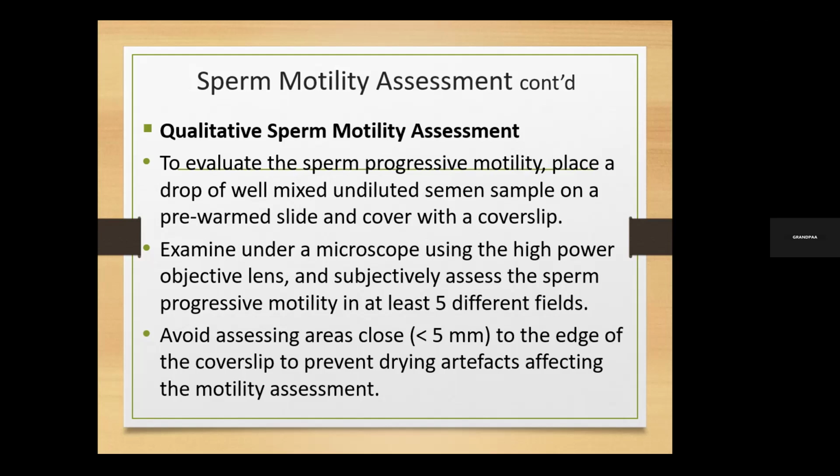So, anytime you prepare a fresh wet mount, there's a current flow, so it has to stabilize. That's the first thing: stabilization of the slide and the current movement. Good. But if you allow it to stay for long, then that's going to cause a different problem, where the slide will begin to dry up.